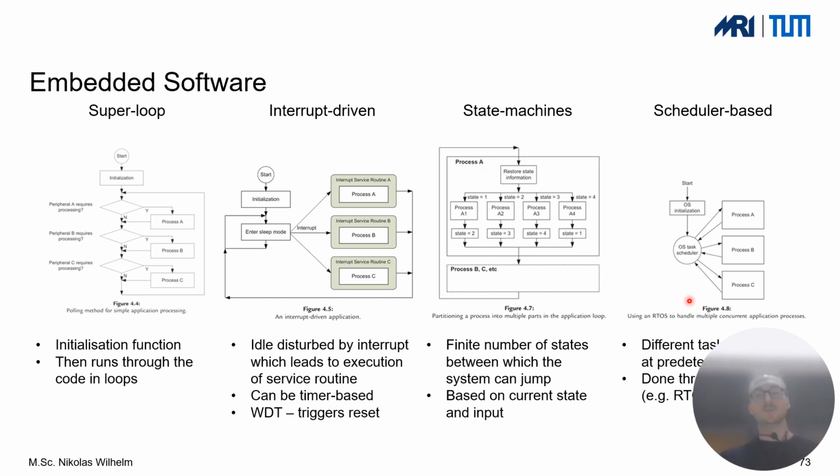And then depending on what you're going to be using, maybe also something like a scheduler-based system is a good idea. So the main thing here is you have maybe a long system or a long measurement that's going to be running. And for example, every day at midnight, you want to perform some certain critical measurements.